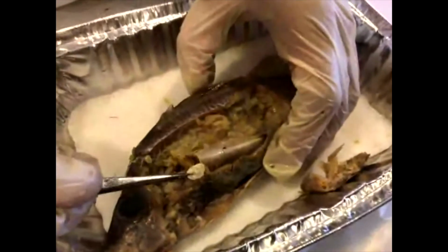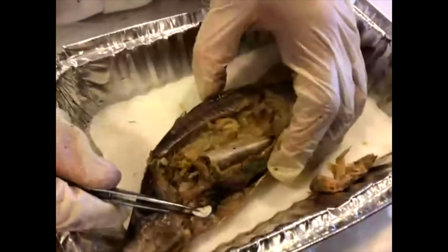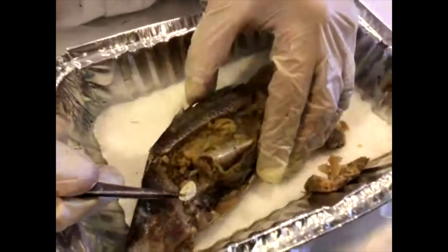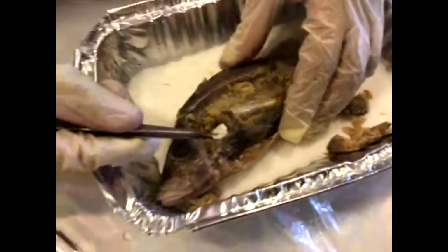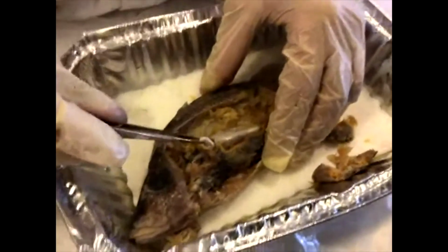So something I just extracted by accident here. Maybe if I hold it over the dark thing it's easier to see. If anyone can guess what this is, I'll give them a high five across the screen. But this is a hard bone. It was not connected to anything else. And you might not even think that fish necessarily have this organ, but this is an ear bone. Did someone guess? Claudia's got ear, yeah.